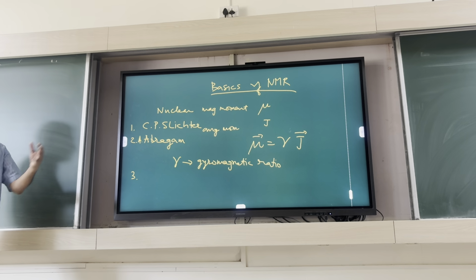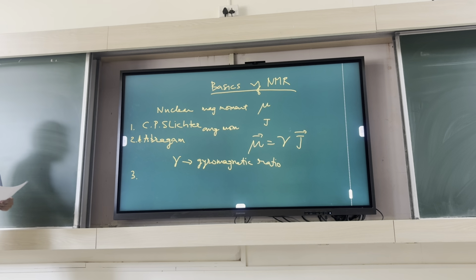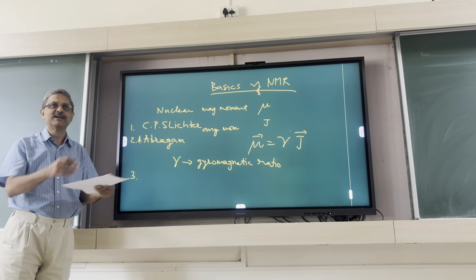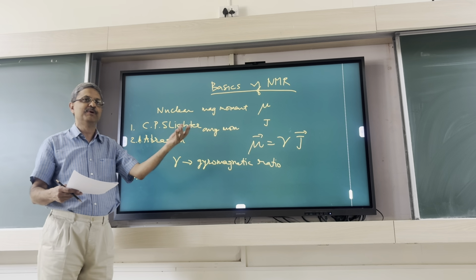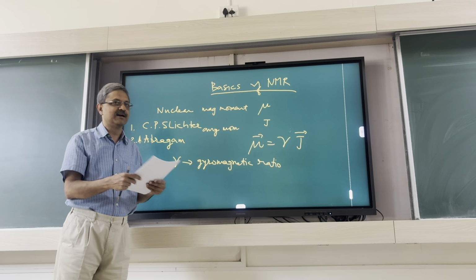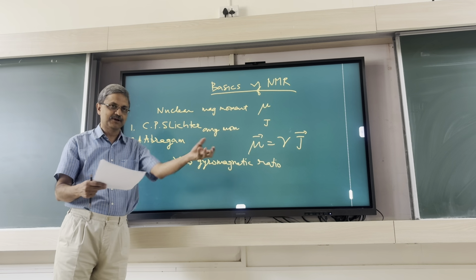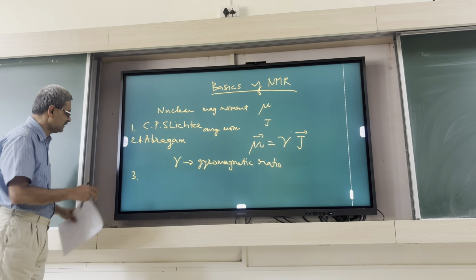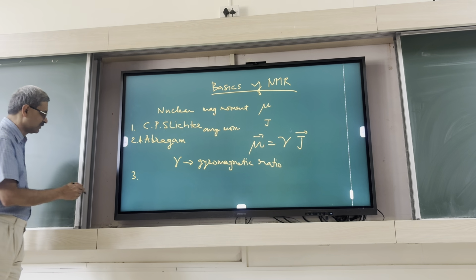So actually, you have a spectrometer, you have a magnet. How do you put the sample? What do you actually measure? What do you vary? More in terms of, you don't do operators and all. In a lab, you cannot be measuring some operator. You're actually having some circuit, you're applying some current or voltage and field, and then you're measuring something. So what are you actually doing to get insight into these things? There's such a book called Nuts and Bolts of NMR.